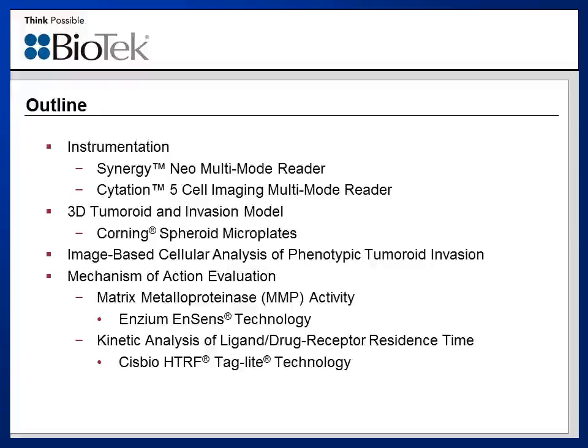Then we'll look at how the Cytation 5 and spheroid microplates were used together in combination with BioTek's Gen5 data analysis software to easily and accurately observe and quantify changes to the tumoroid structure following chemoattractant and inhibitor additions.